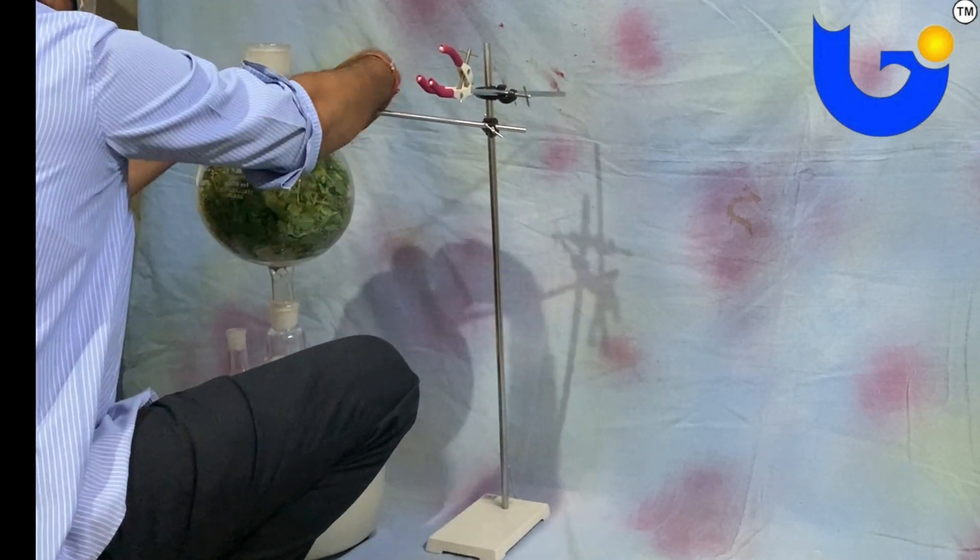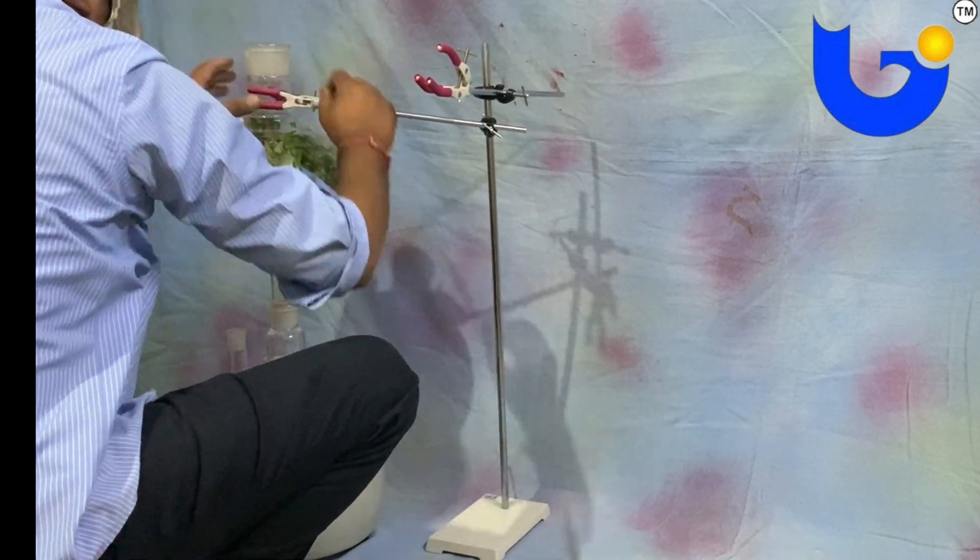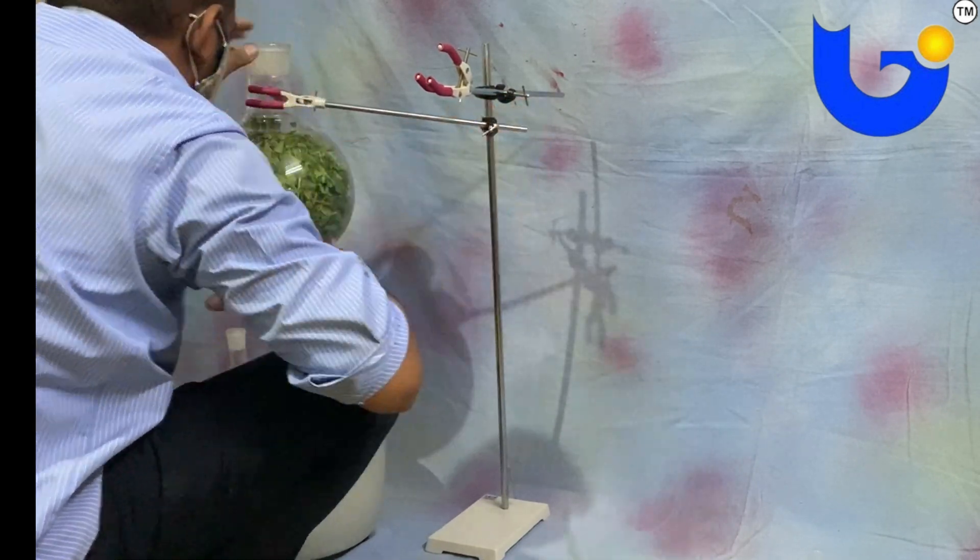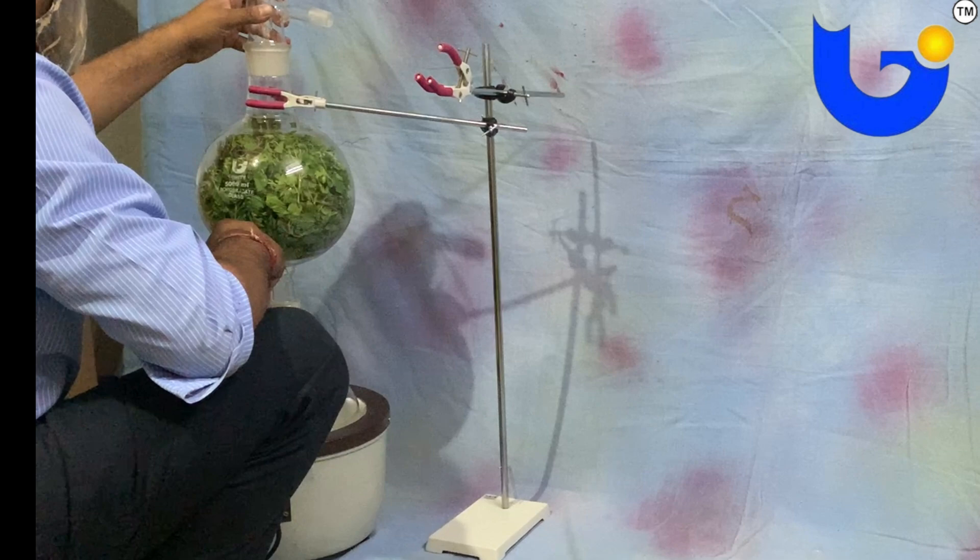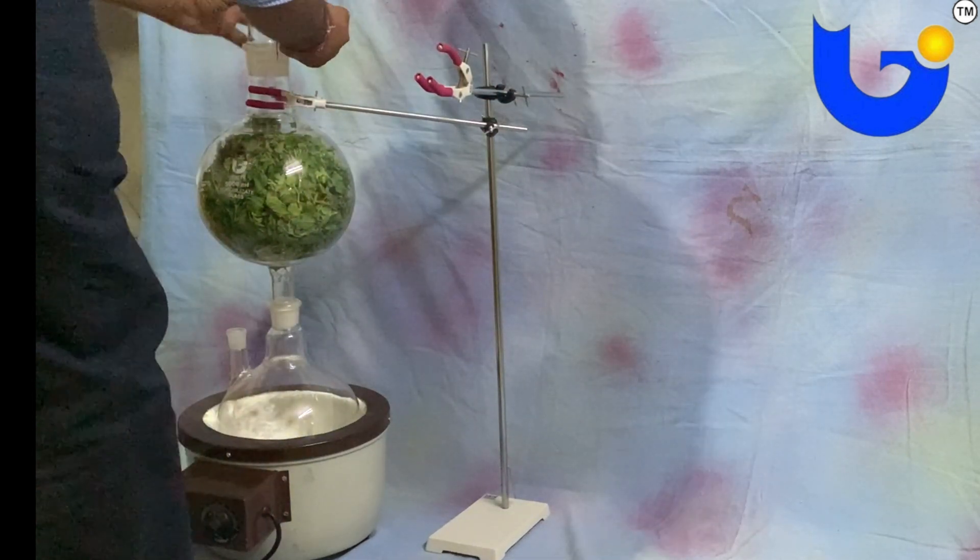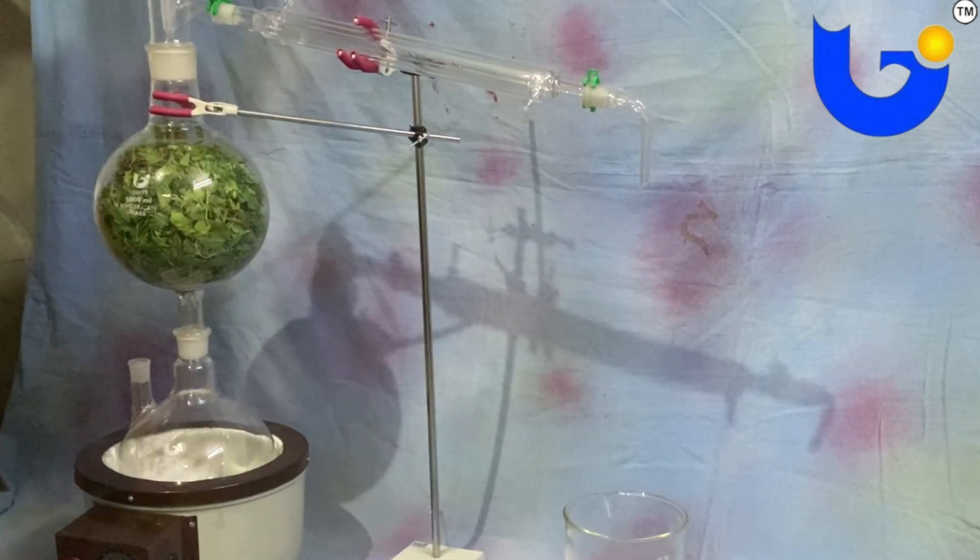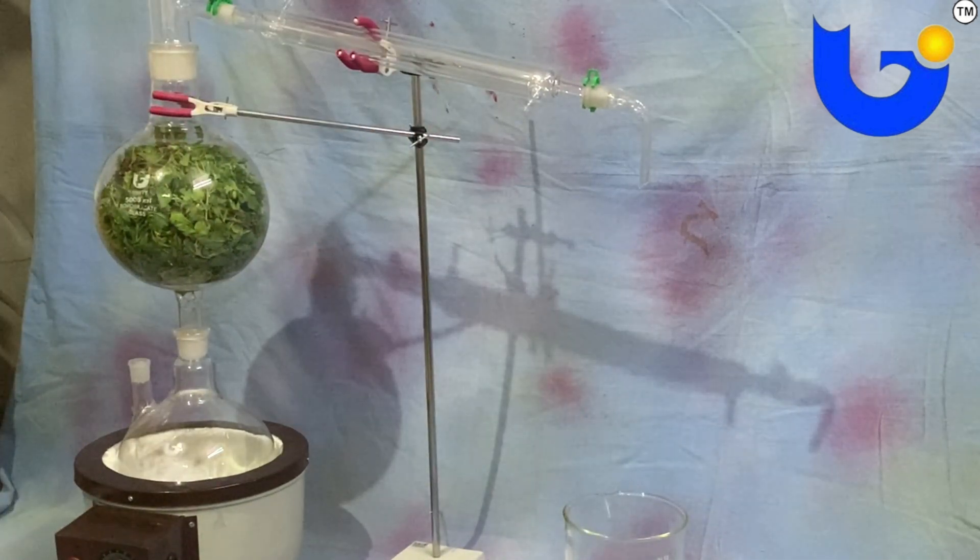So now the question is what is essential oil? Essential oil is concentrated liquid containing volatile compounds from plants. An essential oil is essential in the sense that it contains the essence of the plant's fragrance, the characteristic fragrance of the plant from which it is derived.